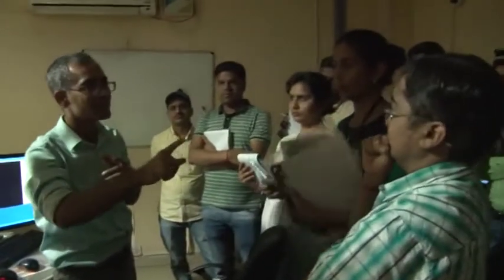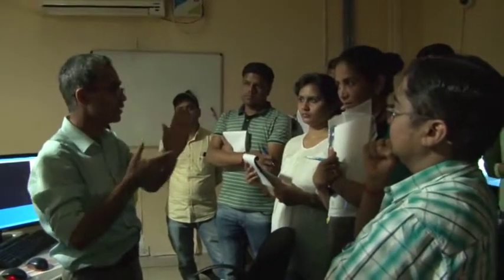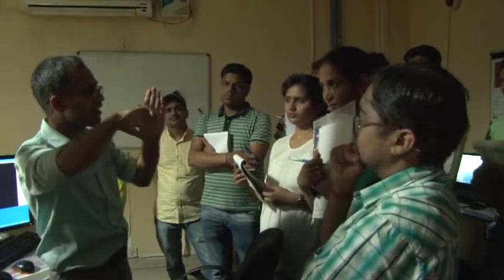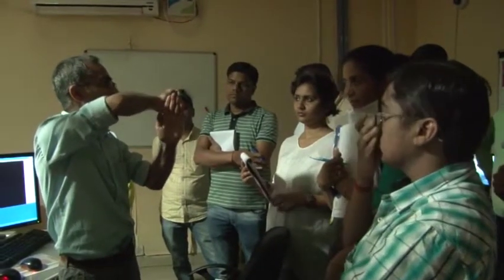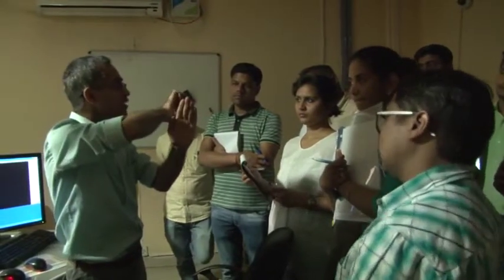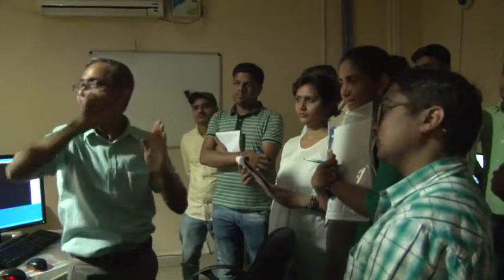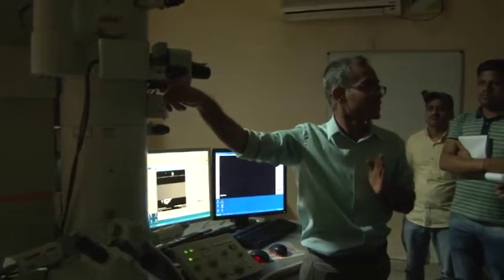I mean back focal plane. Yes, correct. Back focal plane should be there, in which the diffraction pattern should happen. Suppose this is a lens, and this is parallel light which is coming, then that lens will make a point at the diffraction pattern. The parallel rays will be focused at the back focal plane, and that back focal plane is actually where our objective aperture is.